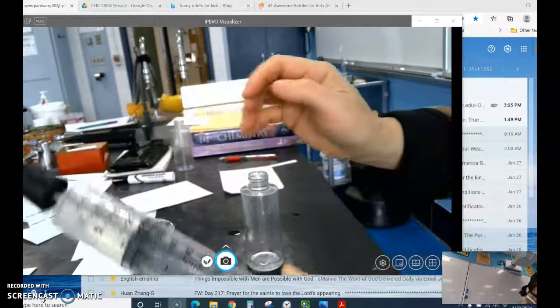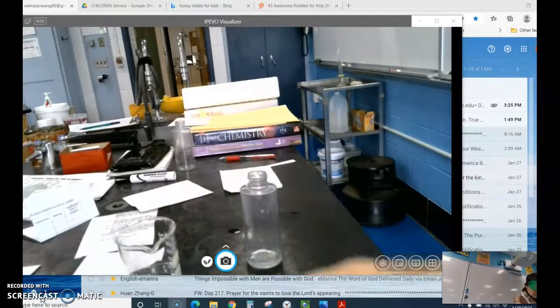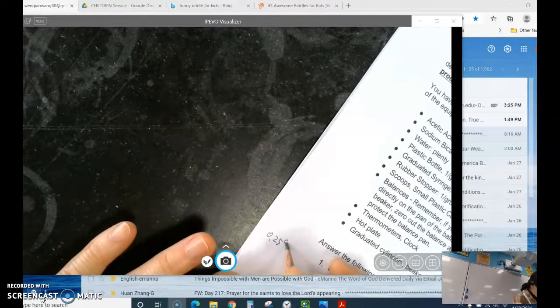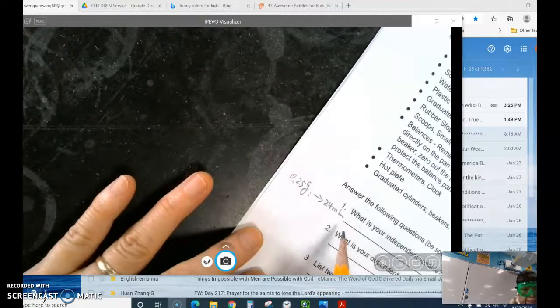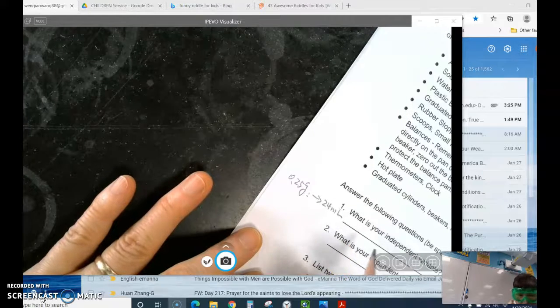So you would write on your paper at this time, and then later you can put this into a nice table. Somewhere I'm going to write down when it is 0.25 gram. This one is formed 24 milliliter. So this is just a brief note, not a data table. It is your job to organize this into a beautiful data table.